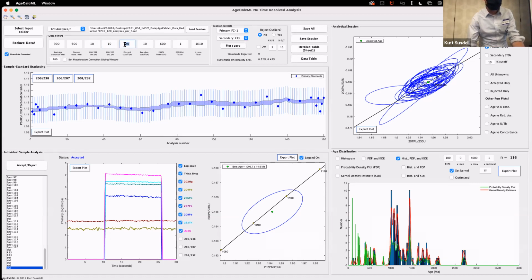Discordance cutoff. So we talked about that, everything older than 600 million years. The discordance cutoff, we set it at 20%. That's actually a pretty loose filter. So everything that has a discordance, or a difference in those two watches, right? Your 6-8 watch and your 6-7. If it's 20% different and it's older than 600, you kick it out, right? You don't delete it forever. You always report it, but you don't use it in your interpretation, again, for reasons that Sarah talked about.